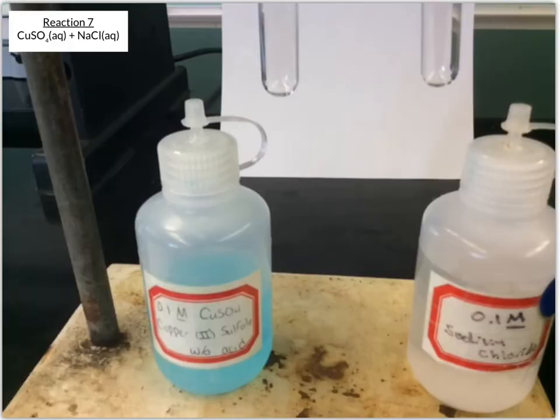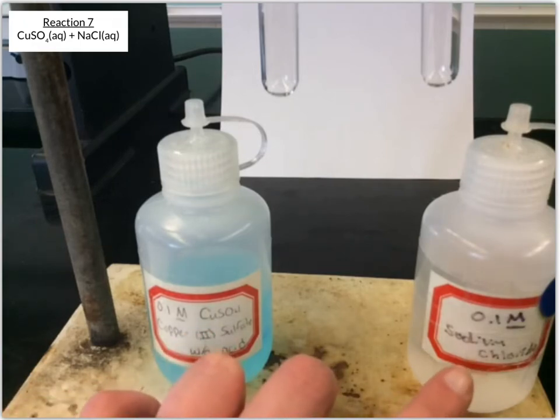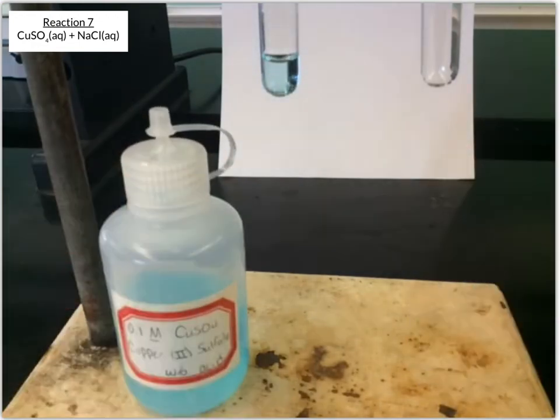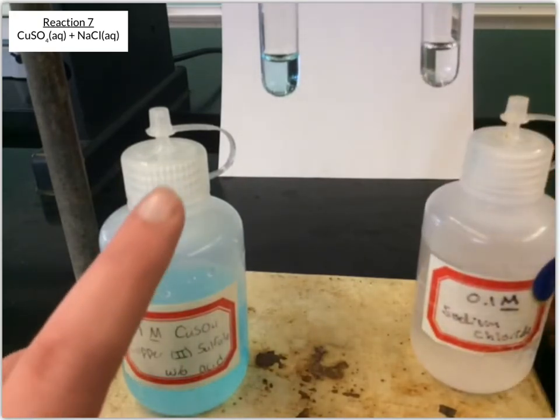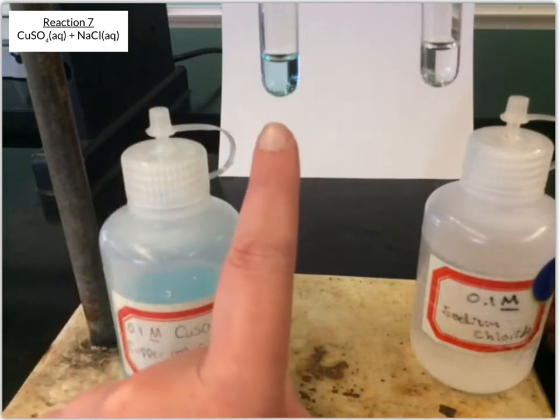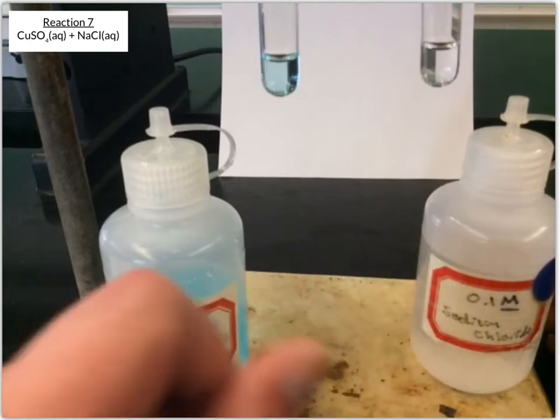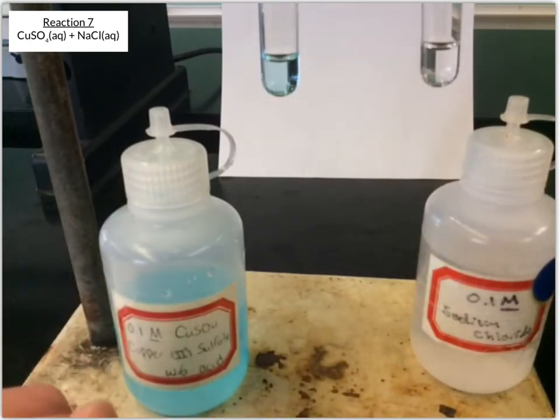Okay, reaction 7, we're going to react copper 2 sulfate with sodium chloride. Okay, so our copper 2 sulfate, as we've seen before, is a clear blue solution, whereas our sodium chloride is a clear colorless solution.